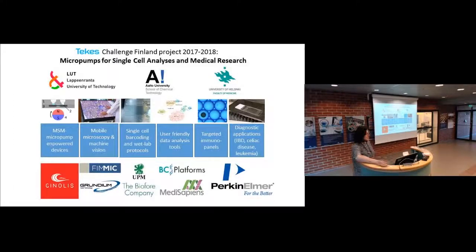Well, for example, the droplet technology: Illumina, Biorad, 10X, they all have exactly the same principle, which was copied from the academic Harvard paper, the DropSeq, which we adapted as a cheaper platform, but more laborious. Now there is competition, because similar devices are coming from other companies as well. The price level in the droplet machines is about 50,000-60,000. But basically they are just boxes with a simple pump pushing the pressure. So for such a box, I think it's quite a high price.